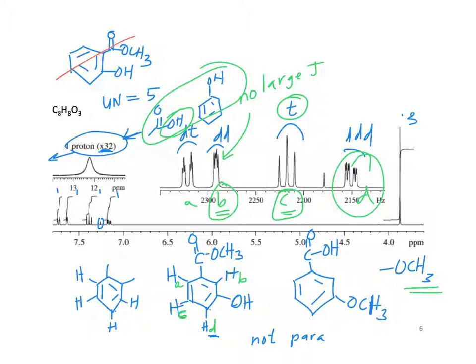But it's a little hard to tell between these two possibilities down here. For me, looking at this OH here, it feels more like it's the carboxylic acid, like this.